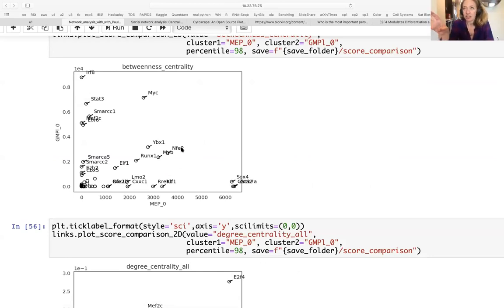So you say that gene is important for propagating a signal through a network, essentially. Yes, exactly. The number means that if we block this connection or this node, this number will be lost in the network. So betweenness centrality represents direct and indirect connection, and this gene is really important because it is propagating many signals in the network.